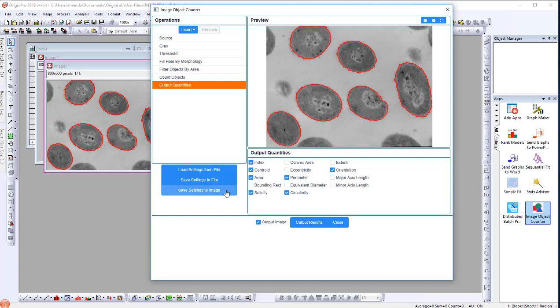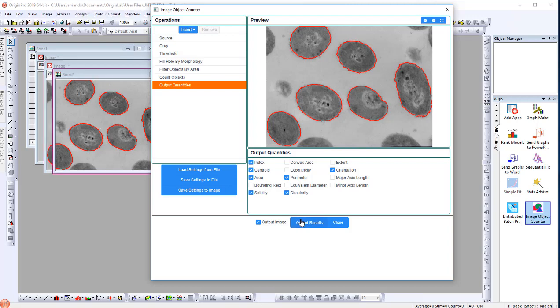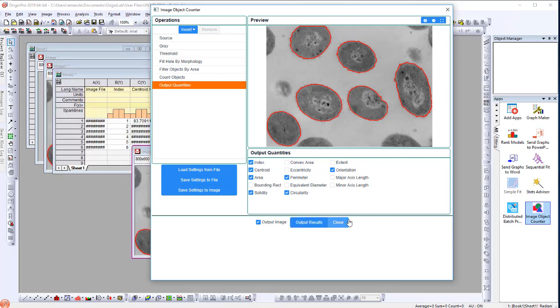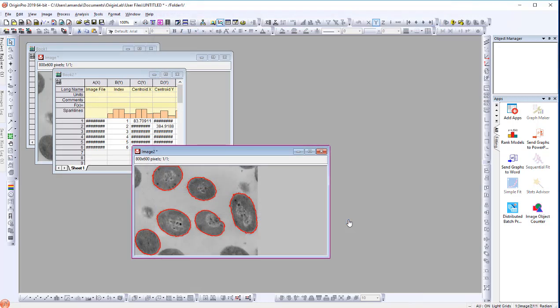Now, make sure the Output Image is checked, and when clicking the Output Results button, it will create a workbook with the measurement results.